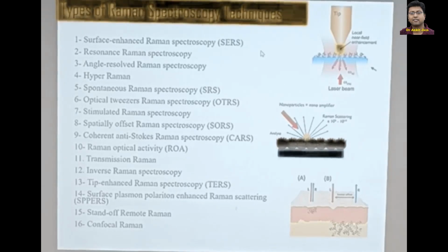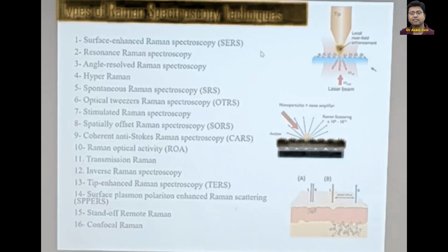You can have externally stimulated Raman spectroscopy, coherent anti-Stokes, Stokes, inverse Raman, tip enhanced. You can have the incoming laser come through a tip. And when we talk about tips, they are high electromagnetic carriers. The localized near field becomes so large that your Raman signal intensity increases, by about 10 to the power 4 times. So you are increasing the intensity of the incoming laser wavelength, and that is why your sample will give you more response.